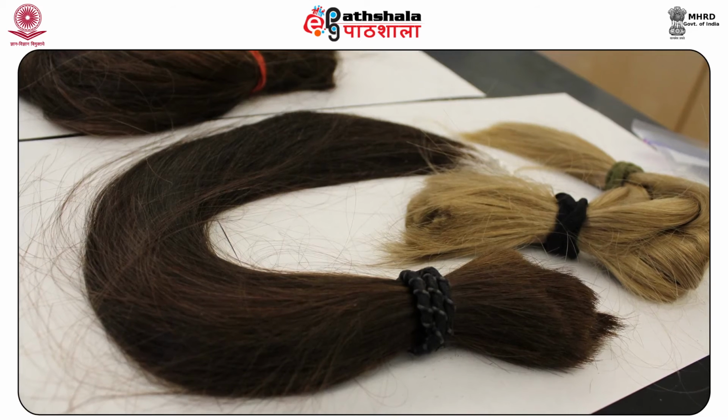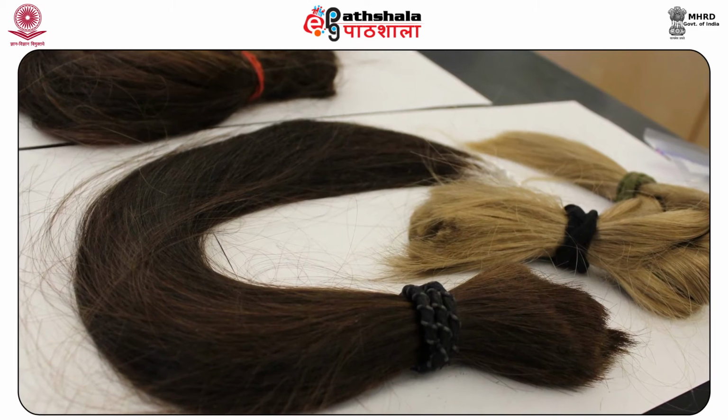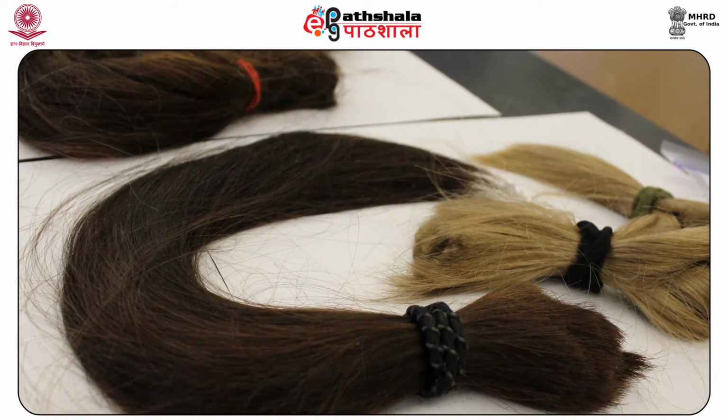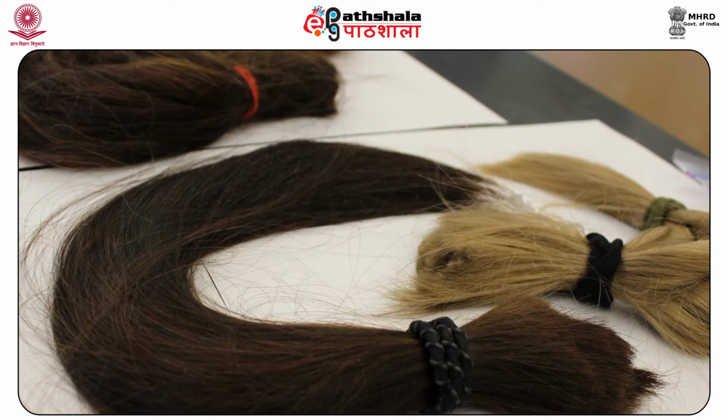Next is the pigment distribution in hairs. It is helpful in the study of species of origin and in the identification of hairs of an individual. It is often an important characteristic and permits elimination of certain suspected sources of hair.